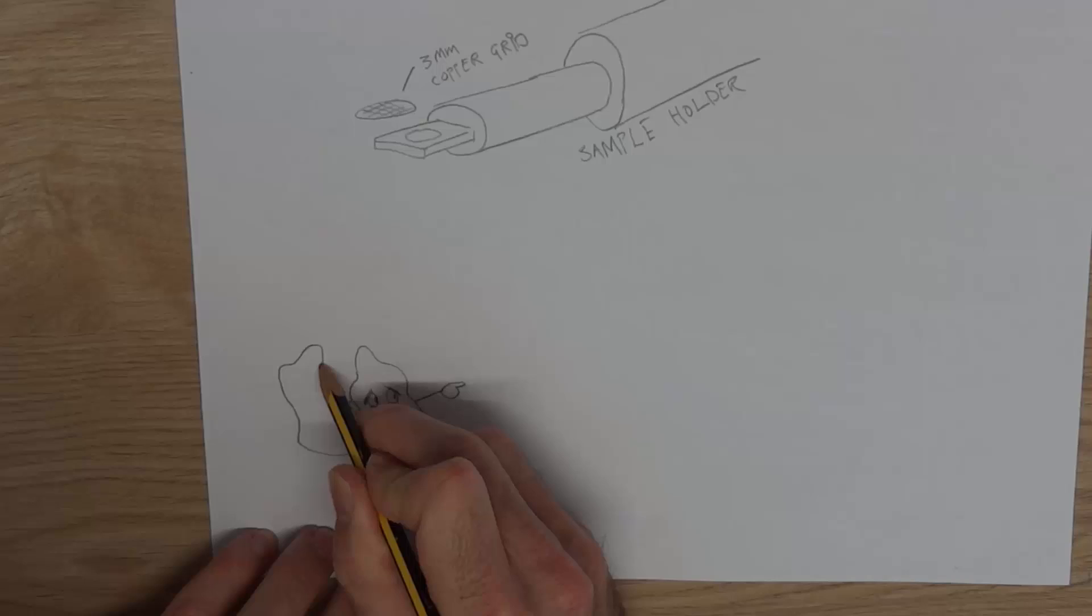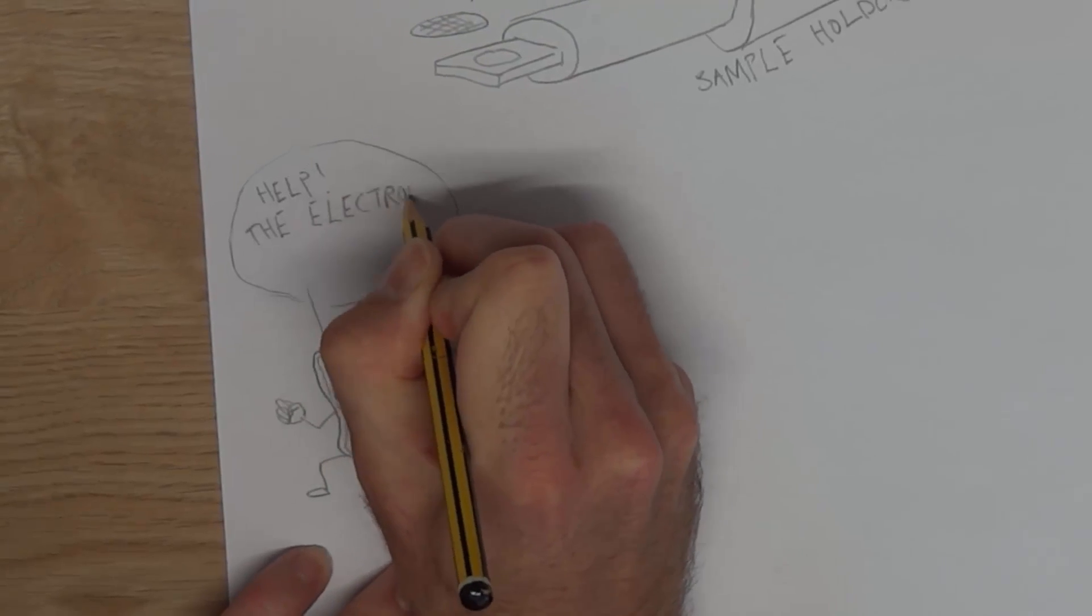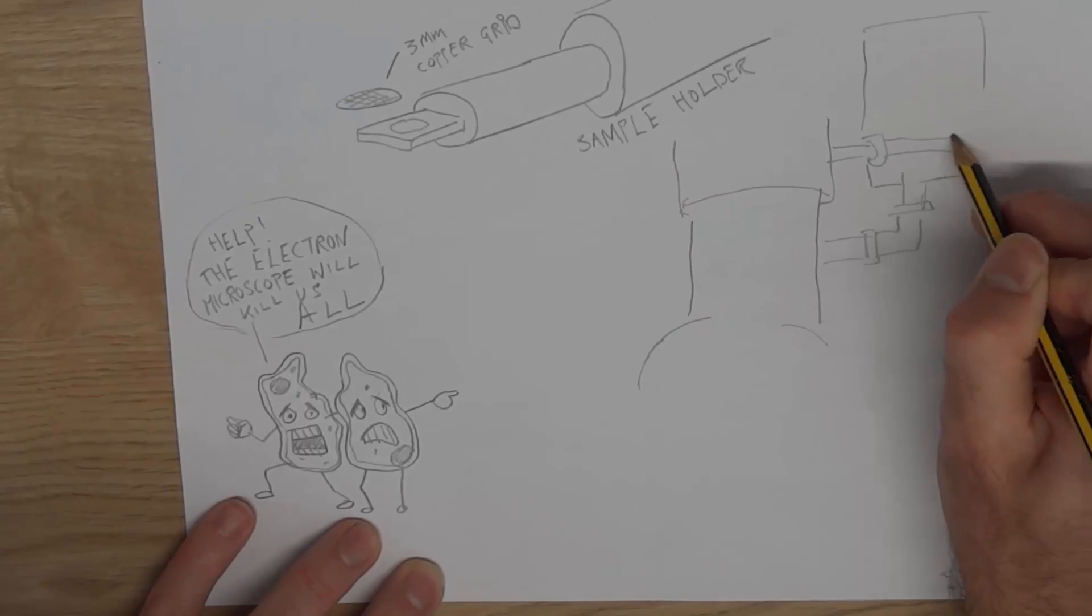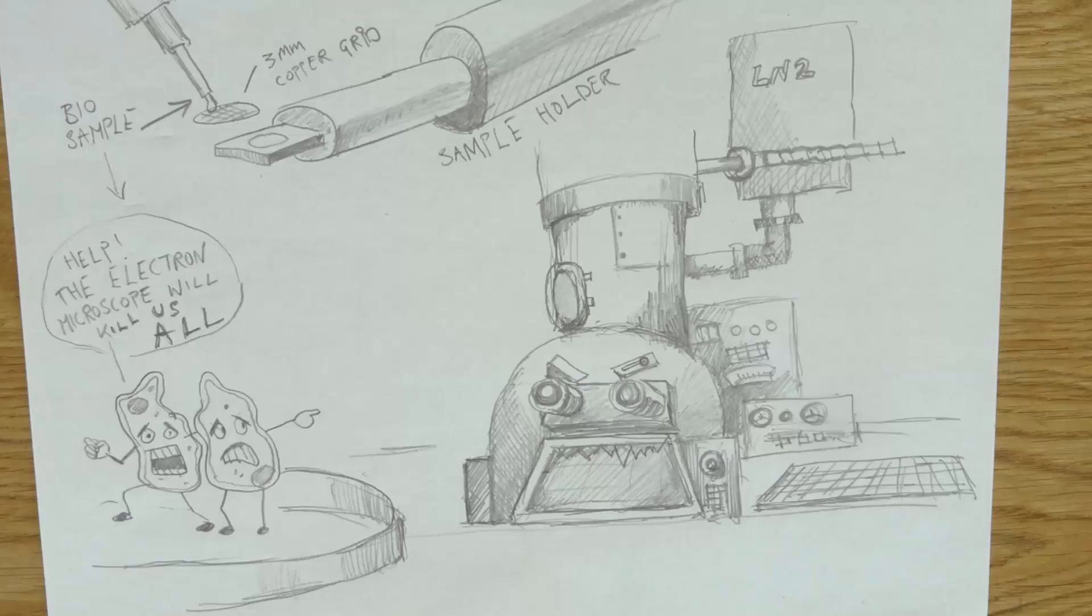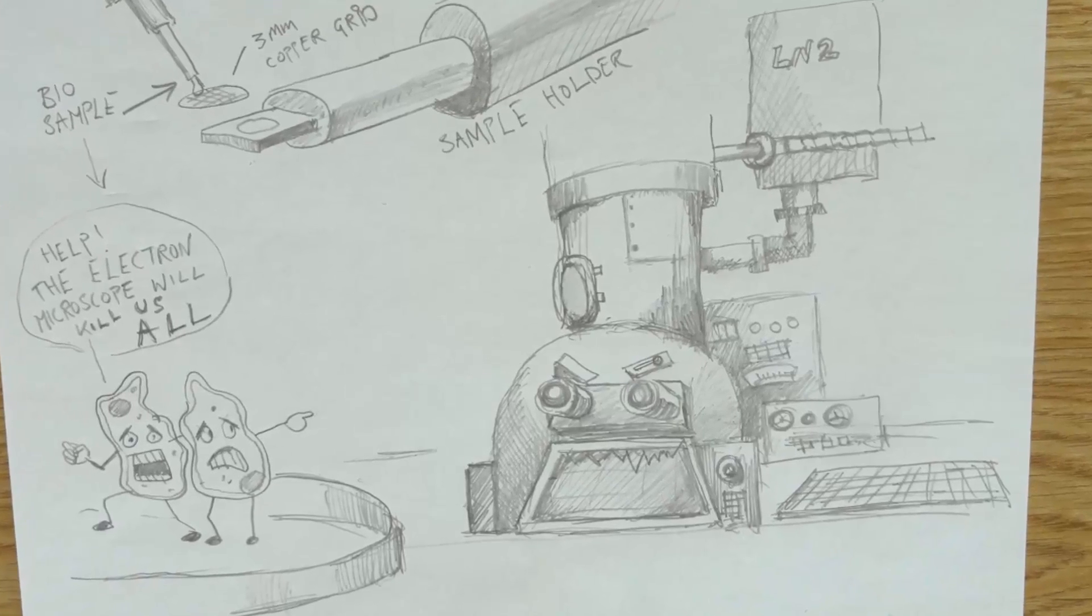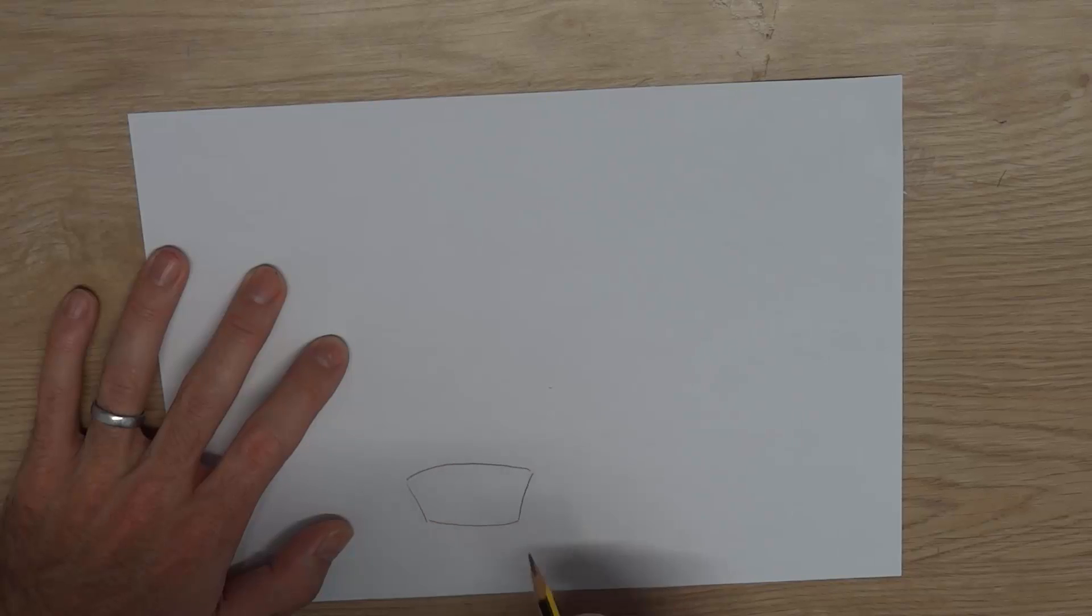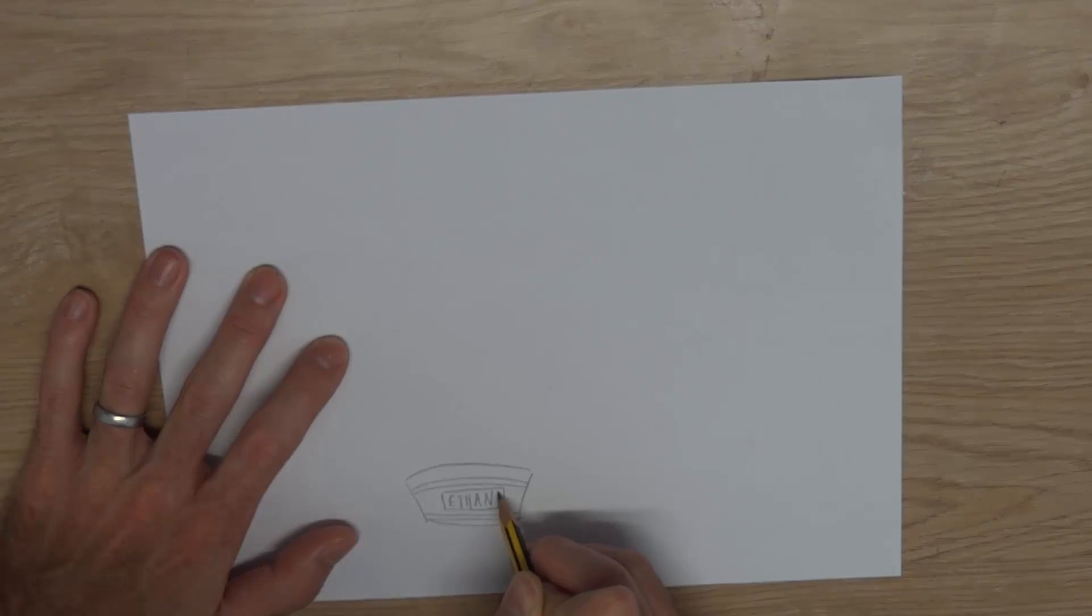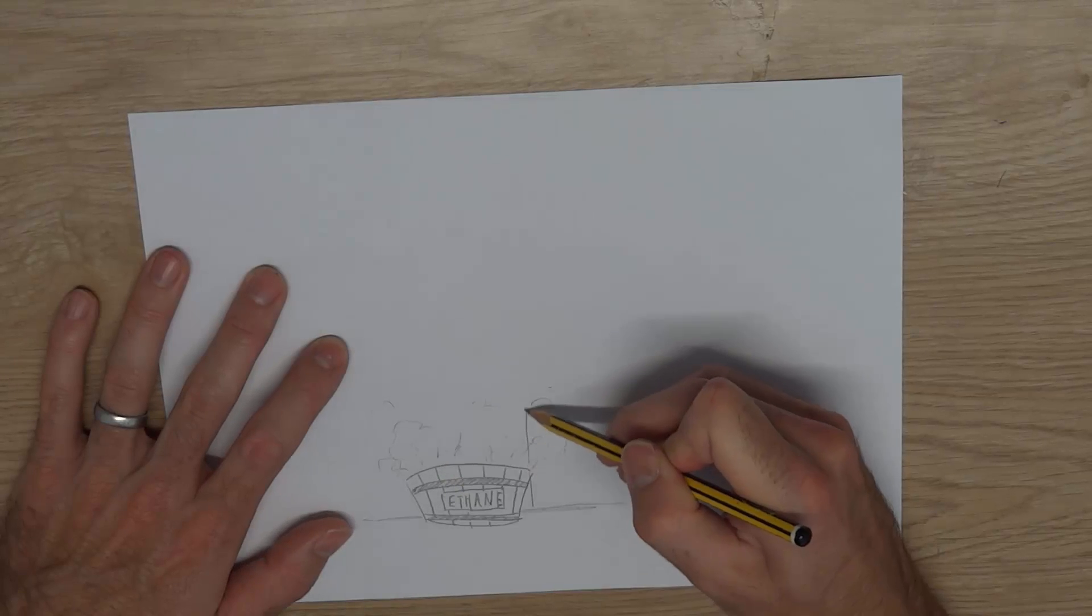However, the sample chamber of an electron microscope is a harsh environment for biological cells. High vacuum and the focused electron beam will quickly destroy most living cells, so samples must be chemically fixed or frozen. It is generally recognised that rapid freezing is the best technique for preparing samples for electron microscopy.